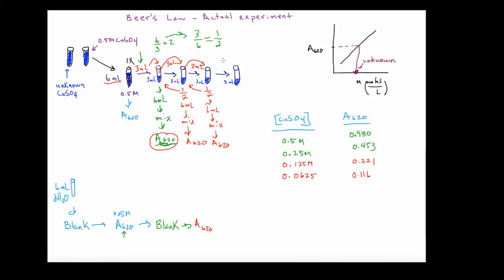The final dilution is done exactly the same way — no change in procedure. We transfer another 3 milliliters, mix, mix, mix, then take our A620 after blanking the instrument a few times. My last concentration value is 0.03125 molar — I'm not paying attention to sig figs here — and my absorbance is 0.077.